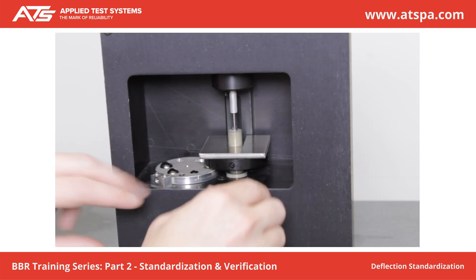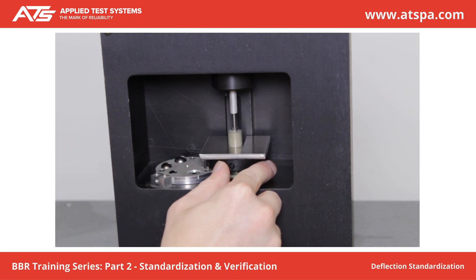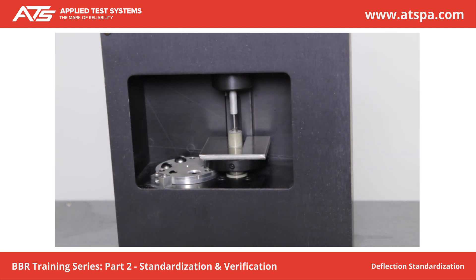Take note of the calibration constant. Manually lift loading shaft and rotate step disc to D. Wait 5 seconds. Press Next. Take note of the calibration constant. Press Finish.